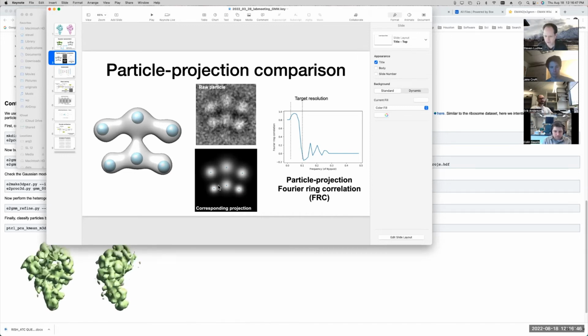All right. Now, if there's, yeah, ask. Yeah. So I understand you picking the number of Gaussians, and then is it going to determine where those Gaussians are, just hierarchically, like based off of density? Like, how then, are you telling it? The process is started with a single consensus 3D structure.